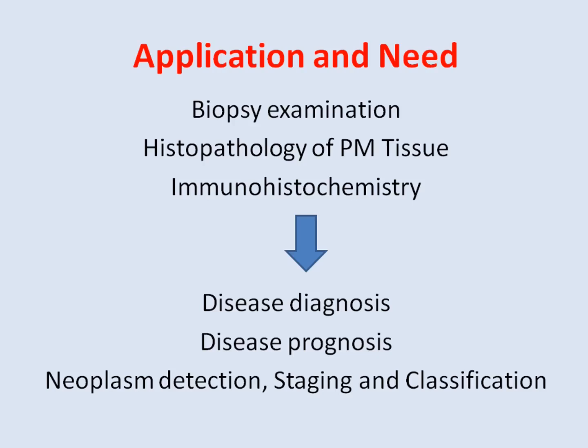When we conduct any post-mortem, whether for infectious disease or by pharma industry personnel in the research sector, various tissues, lung, liver, kidney, heart, spleen, etc., are collected. To know the cellular injury or cellular details, we have to go for histopathology examination.